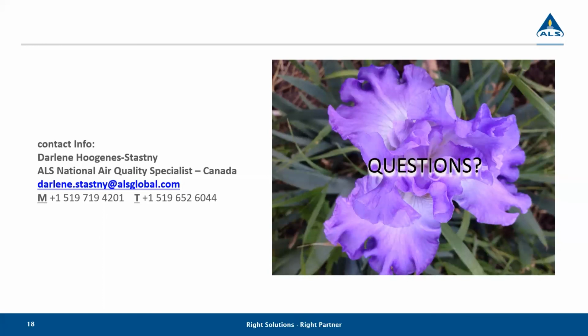So I agree with you in that after tubes have been in use for a period of time, the active TD tubes do end up having breakthrough. And so we do check these tubes. When we do the batch proofing, they are monitored to check for breakthrough, and any ones that don't pass quality control are pulled out of circulation pretty much right away.